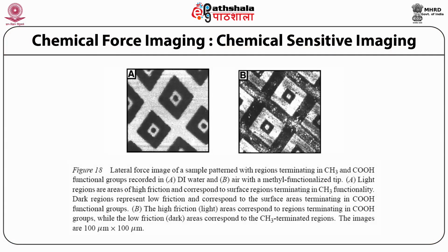The lateral force image of a sample patterned with regions terminating in CH3 and an acidic group COOH was recorded in DI water and air with a methyl functionalized tip. In the first photograph, section A, light regions are areas of high friction, corresponding to surface regions terminating in CH3 functionality.